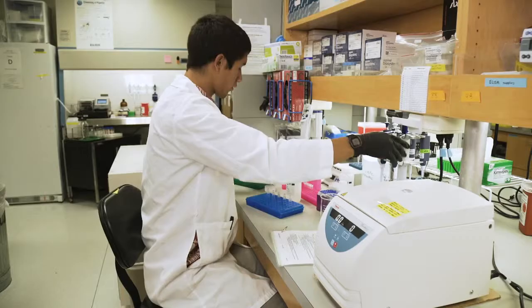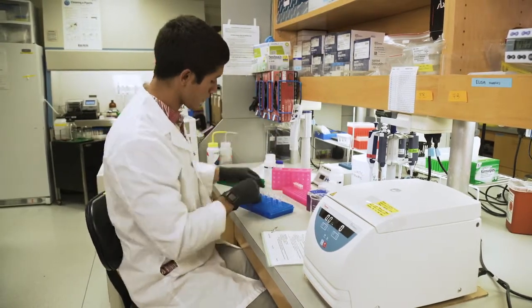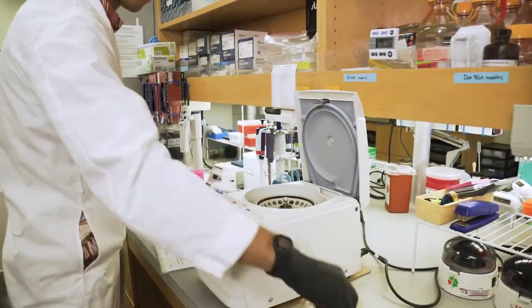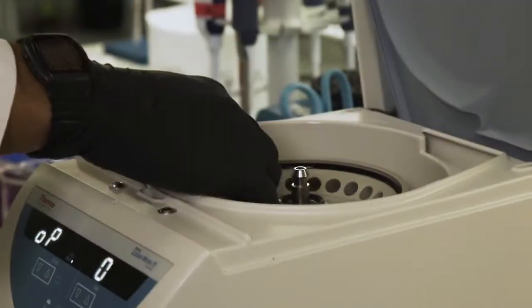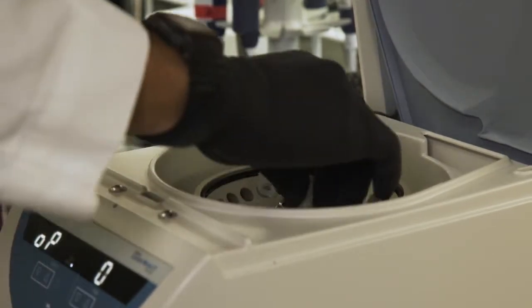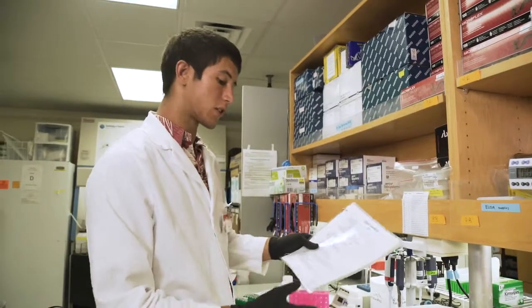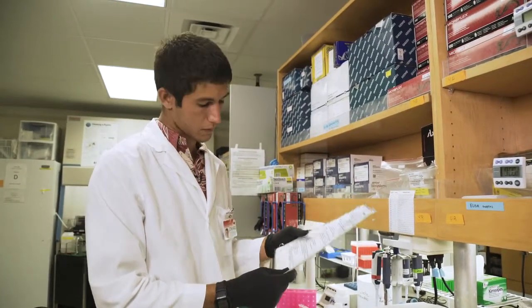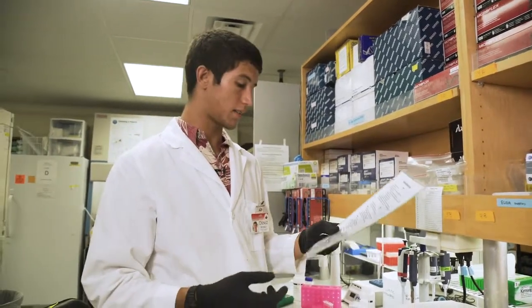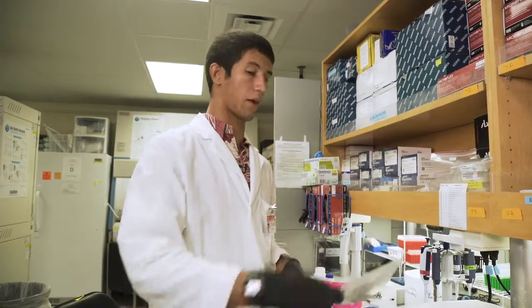All right, so the first wash buffer has been added. Now we go ahead and load it back into our centrifuge, making sure every time we load our centrifuge that it's balanced. So we're going to read ahead while this spins. The flow through, the stuff that ends up in the collection tube, is still going to be waste in this one. So what we're going to do is the same thing we did with the last one.